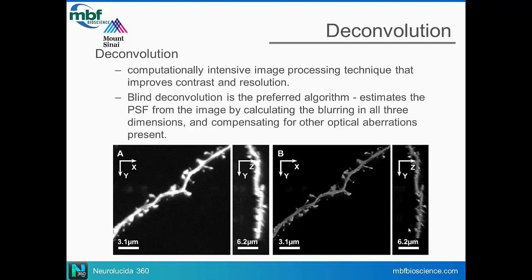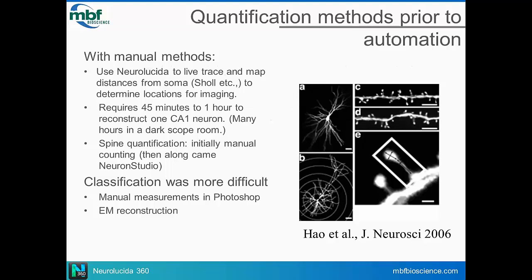So now that you've got your nice, clean, crisp, clear, deconvolved image data, tell us how you quantified.